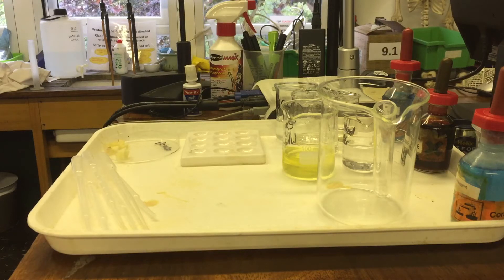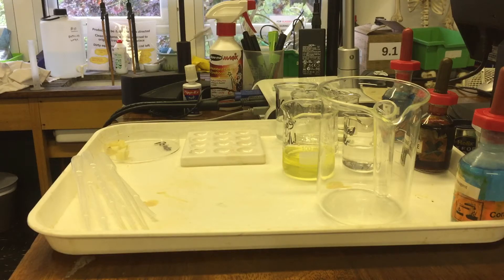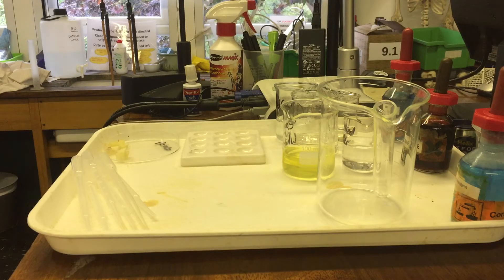All right, so today we're going to look at some food tests and how you test them. Now this is stuff you would have also done in year 8, maybe in year 7. But these are on the GCSE specification and we need to be aware of the test for four different food types.